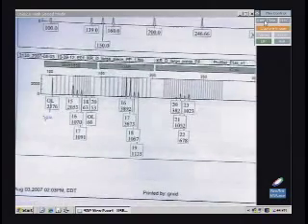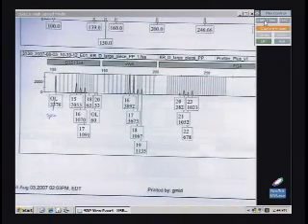I'm going to point out the first one is a mixture, because that's what she did. She just cut a big cutting, and this is just one of the panels here. So we did get results, and we're like, okay, it's a mixture. The only thing I find interesting is that, using my protocol with the low copy number, if I had done this in my laboratory, everything would have been really off scale. So I know there's something downstream in this lab where we're losing some kind of sensitivity. I don't know what that is.